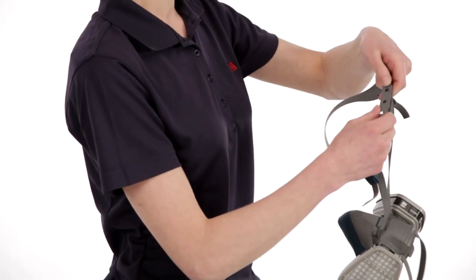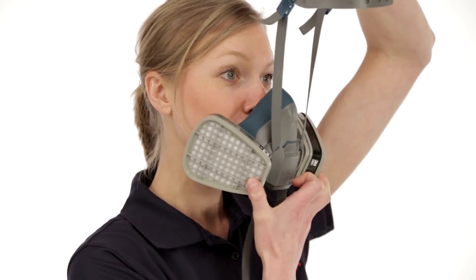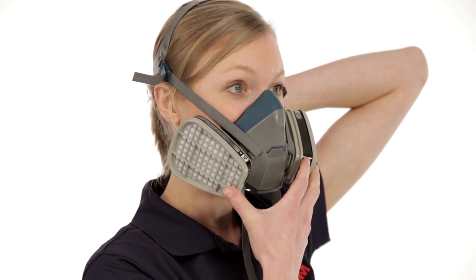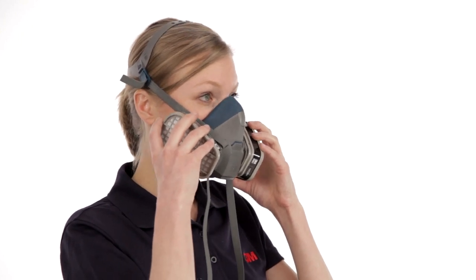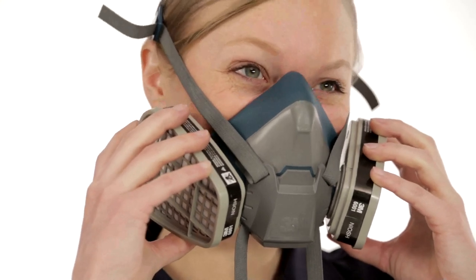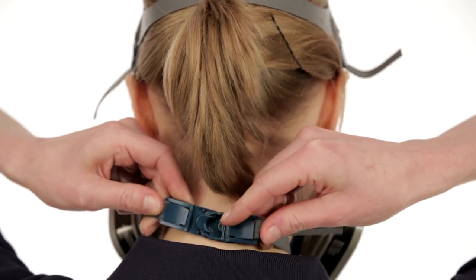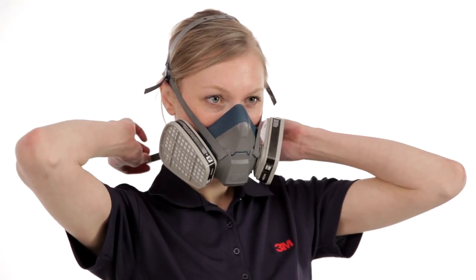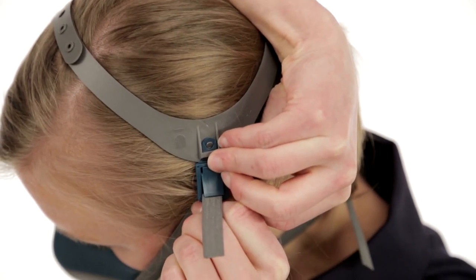Before you put on your respirator, adjust the head cradle size as needed to fit comfortably on your head, making sure the straps are pulled far enough through the buckles to permit easy adjustment. Place the respirator over your mouth and nose, then pull the head harness over the crown of your head. Position the facepiece low on the bridge of your nose for the best possible fit and to prevent the respirator from blocking your vision. Grasp the bottom straps with both hands and hook them behind your neck. Tighten the straps — top straps first, then the bottom — until the respirator fits securely but comfortably. Do not over-tighten; if straps are too tight, push out on the back of the buckles to loosen them.